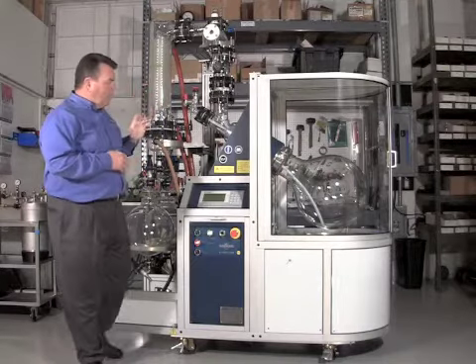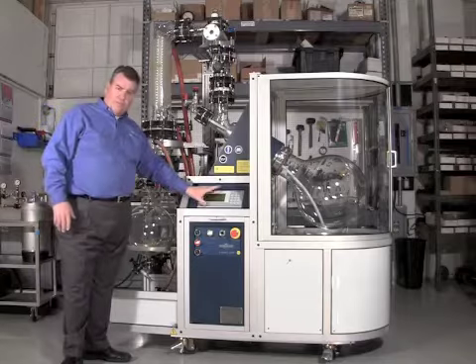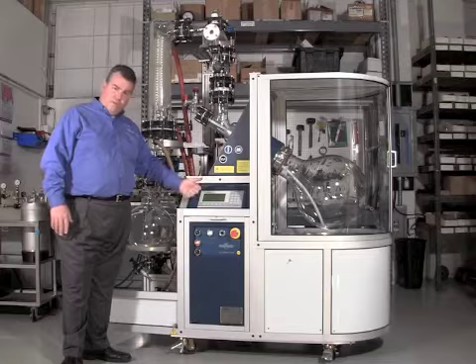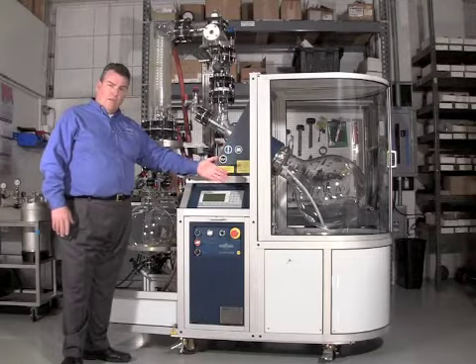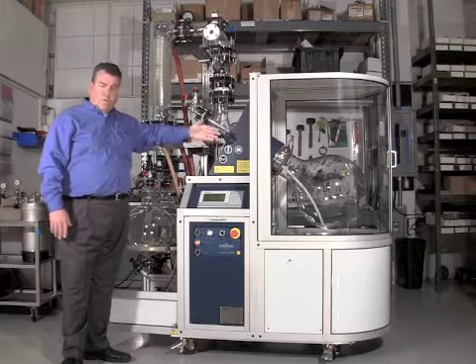The entire unit is also driven by an industrial scale PLC. This PLC can control vacuum, rotation speed, temperature of the water, and also because of the vapor temperature can control the process.